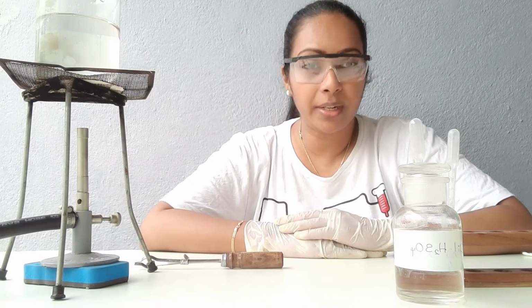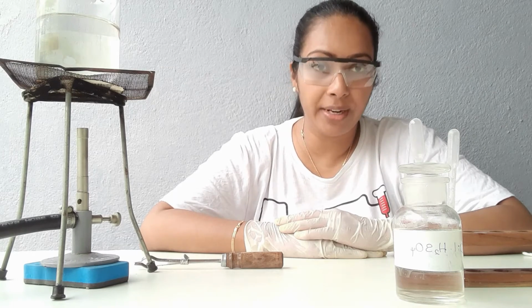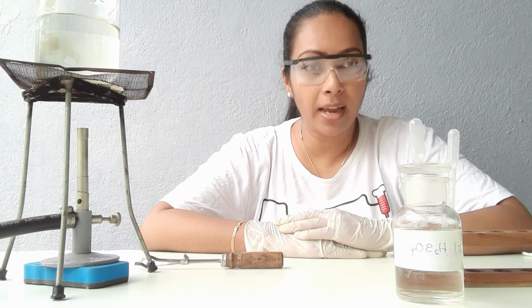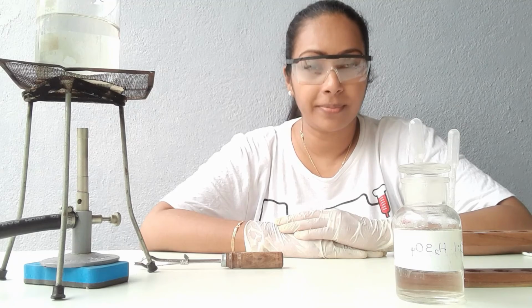So with this video clip, we have completed all three tests that we do under carbohydrates. The iodine test, the Benedict test for monosaccharides, and the Benedict test that we do to identify disaccharides.